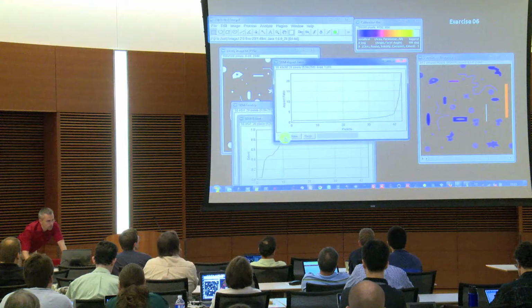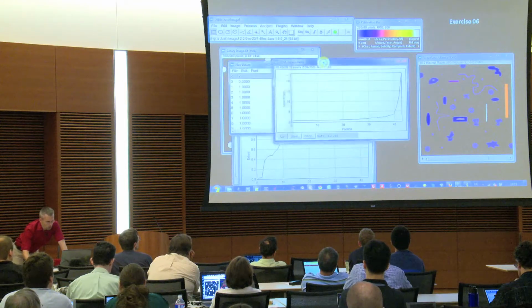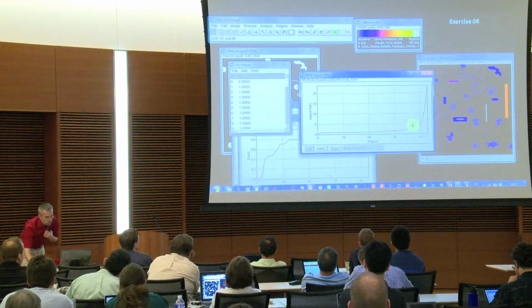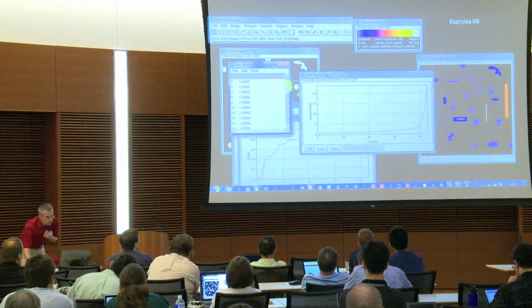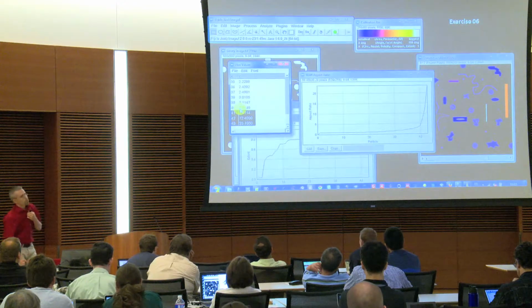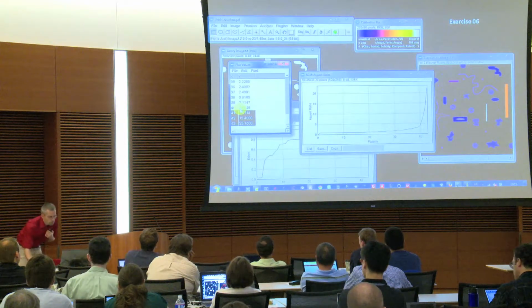So if I click here on list, you see most of the objects actually have a very low aspect ratio because they're not elongated. Those ones have a higher one. So if we go down in the list at the end, then we see here, okay, we have a fairly high aspect ratio. So we could use anything above, for example, 3 or 4, and we should be able to extract them. We can test that.